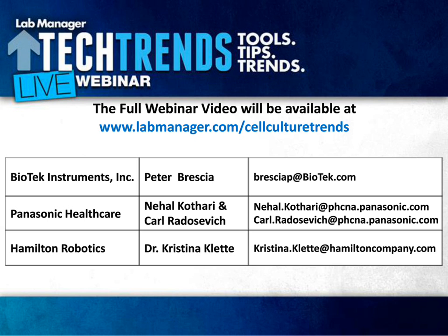Thank you. Peter, any parting words? No, I agree with what both Carl and Kristina said. Additionally, maybe some smaller footprint instruments. I think those are gearing towards the academic lab. We're seeing more interest in some of these cell-based assays moving into academic labs, where cost becomes more important as well. So, smaller footprints, and smaller automation systems, I think, are going to become more trendy as well.